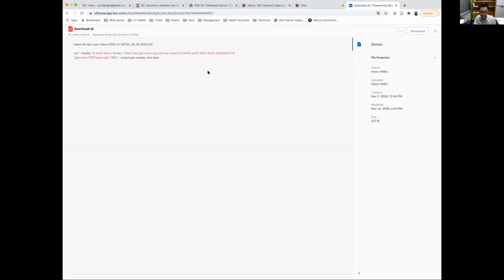So I went back to our own BAMs. We analyzed 1,000 TARGET cases, and all the BAM files are on our own server. I got the slice of BAMs from our own BAM files, and still there are no fusion reads in those BAM files.